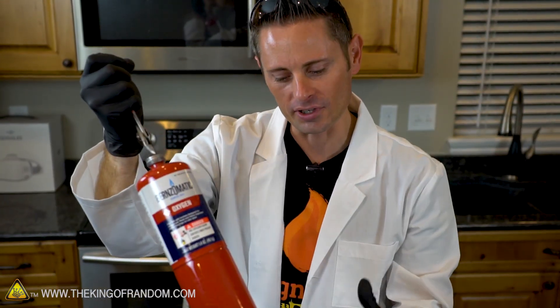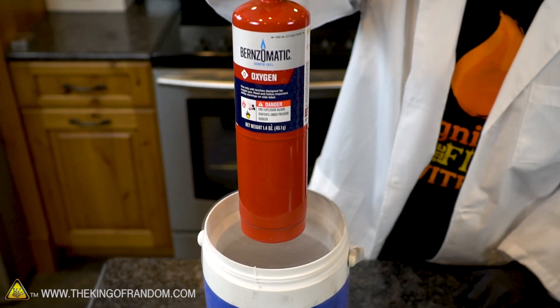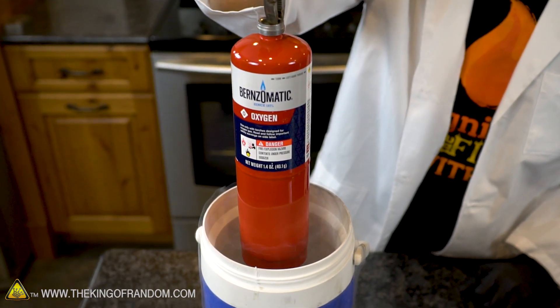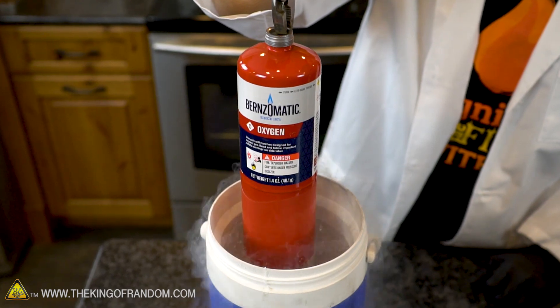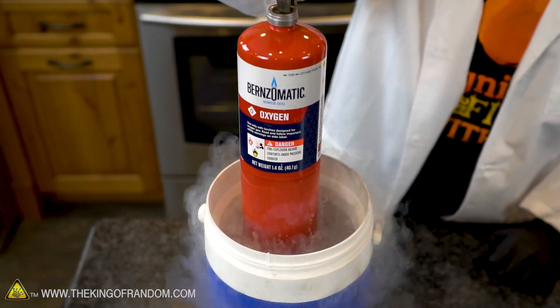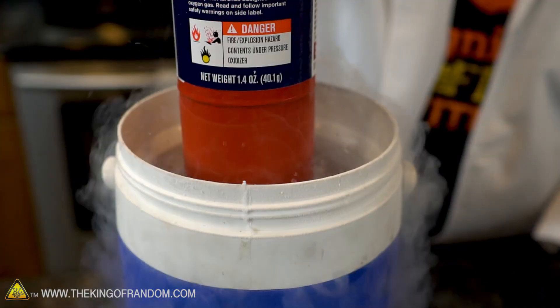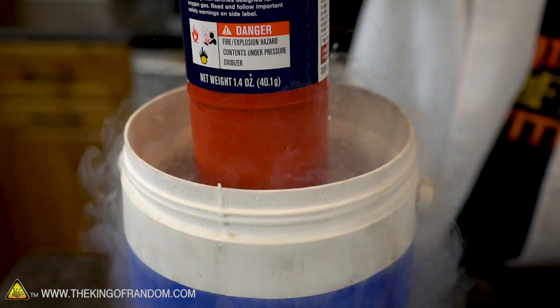It's time to chill it up. Let's get this canister completely submerged. I'm just going to do this nice and slowly because I don't want that nitrogen to boil out the top. Look at the way it jumps - it's jumping like a good two inches high there from all the heat that it's extracting.